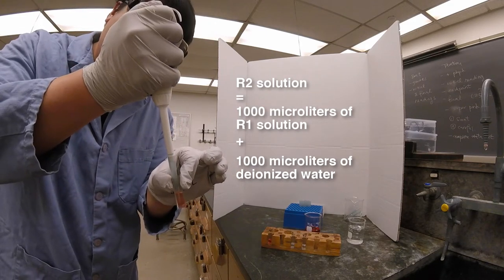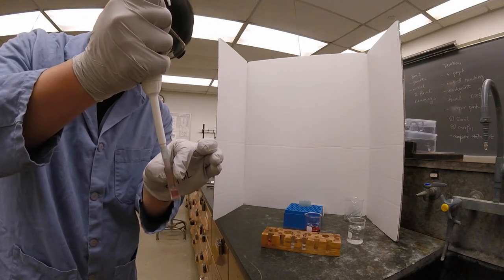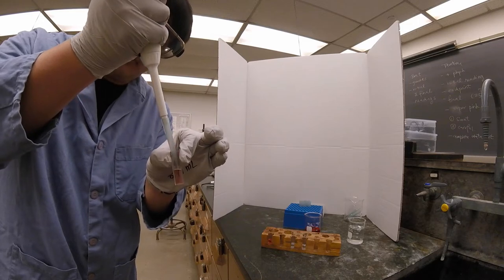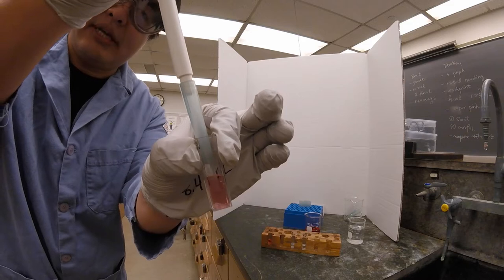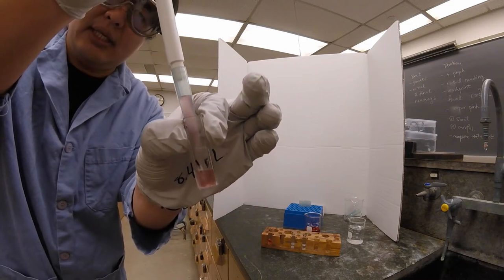And again we're going to mix. So I'm going to put the pipette down, bring it up slowly, bring it back down. Then up and back down. I'm going to do this several more times to get a nice even mix.